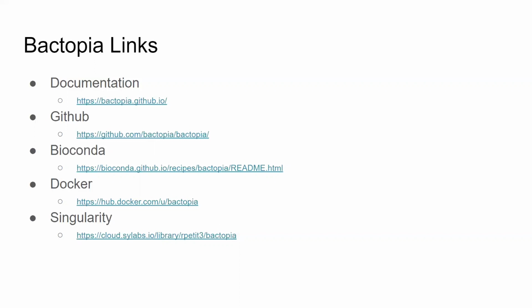And then the next change that I will do for the current version 1 of Staphopia is just implement the table2asn forever bit, just because for the last few years that's been the only change I've made to it, going in there and making sure table2asn has been updated due to its expiration. So if it's working for you, continue to use it, and if it does what you need it to do, go for it. But if you get to where you need to start adjusting things, yes, switch over to Bactopia.